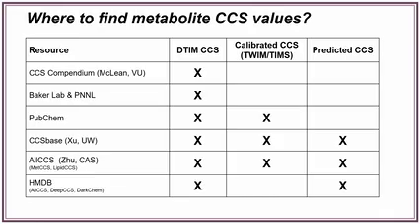Then a couple of sources have a mixture of all of them, and this is because they were originally developed and curated as the training set for machine learning-based CCS prediction. Some examples would be CCSbase from the Xu Lab at University of Washington. The website is ccsbase.net, so you can go on there and look at it.